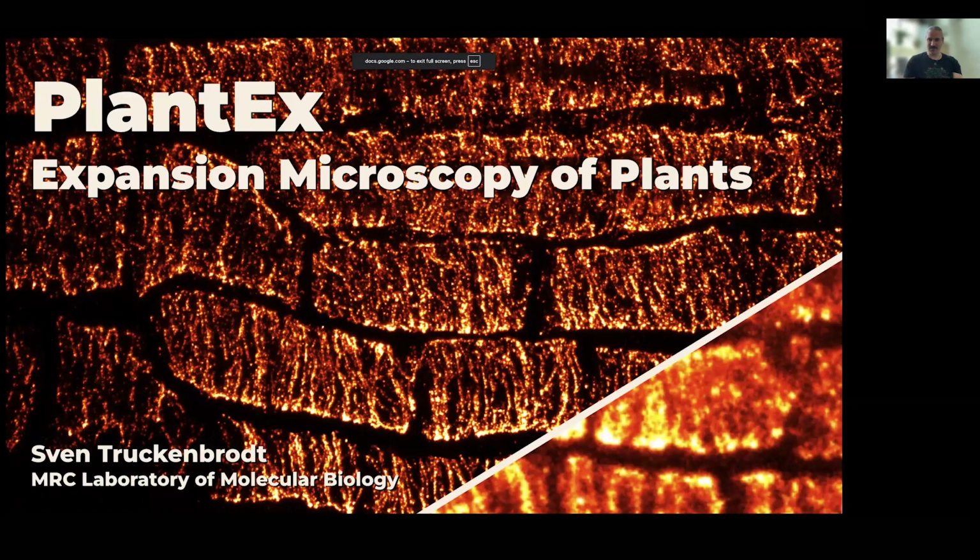Fantastic. I will introduce a technology to you called expansion microscopy, and in particular, how we applied expansion microscopy to plants for the very first time. And I would like to point out this is very much the work of Michelle Gallet that I'm presenting here.